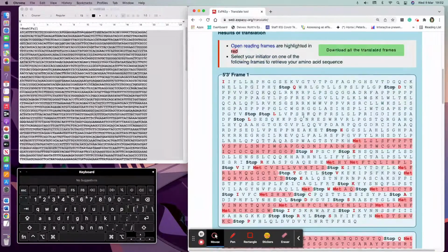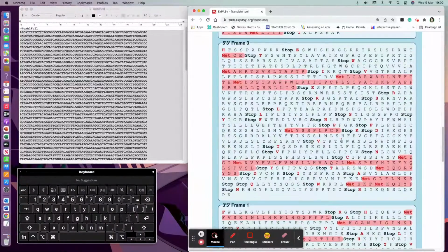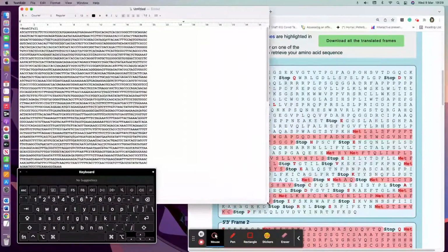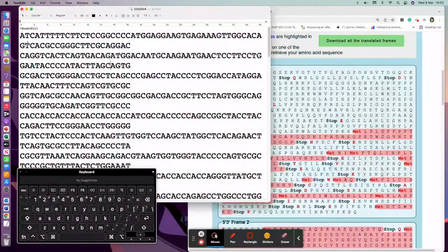And what you have is it just has the single letter codes with stop codons. Now it looks a bit funny, like, I don't know what is happening here. What is happening is that the program doesn't know where the start of the sequence is. So if we come over here for a second, let's get up our sequence here. Okay, let's make this a bit bigger.